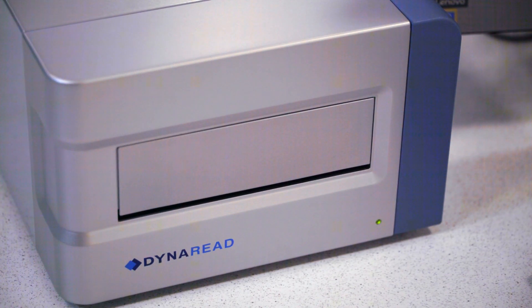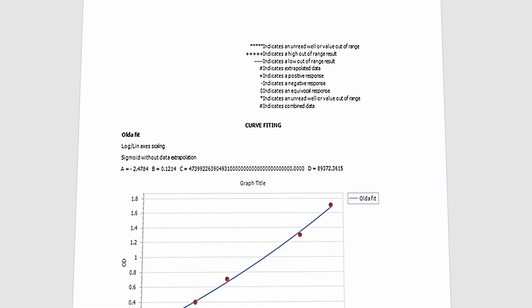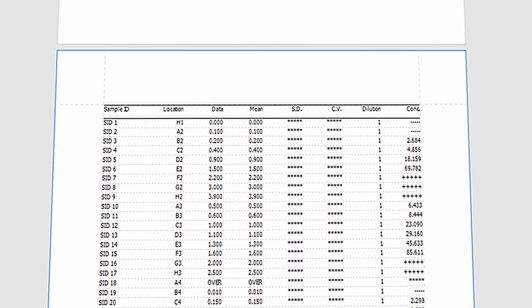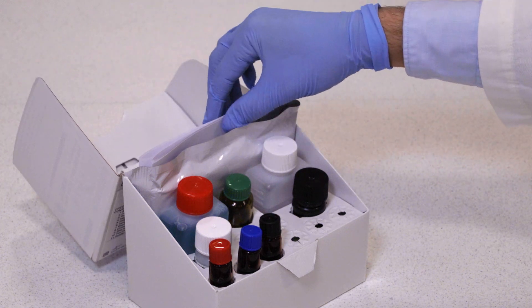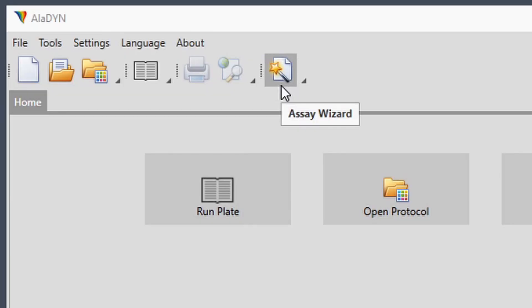After the run, you can immediately see a comprehensible report with all your results and insights. Creating new protocols is very intuitive thanks to the assay wizard.